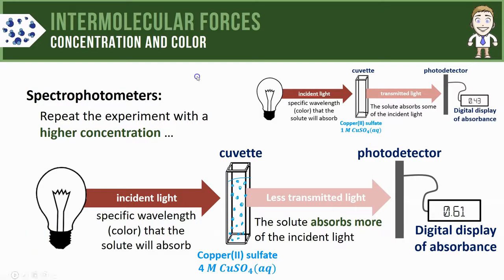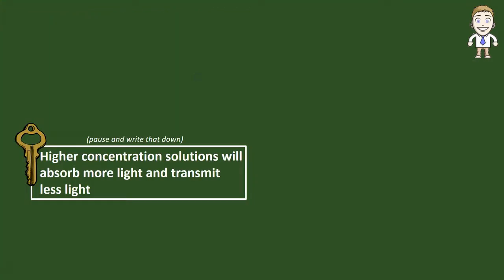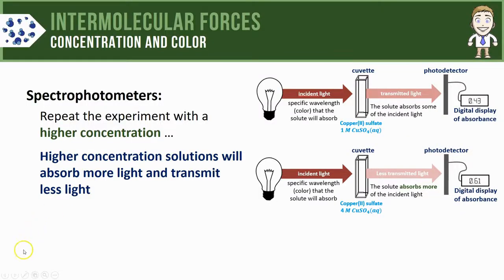We can put these two experiments side by side and summarize this by saying higher concentration solutions will absorb more light and transmit less light, another one of the key ideas for this video.